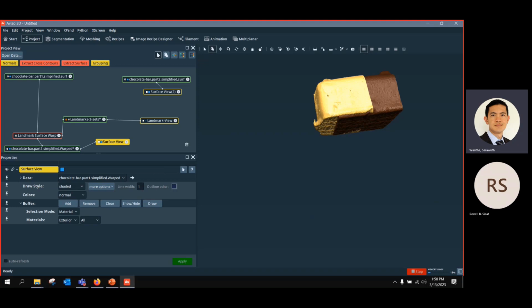Yeah, is the images like this? Pardon? Do we have some tool for 2D images, for example, 2D to 2D? I'm not certain. Yeah, I'm not sure. So it's on the volume also. Yeah, we haven't tried with 2D surface, because usually Avizo is designed for 3D information. You always need 3D information, but you could try.